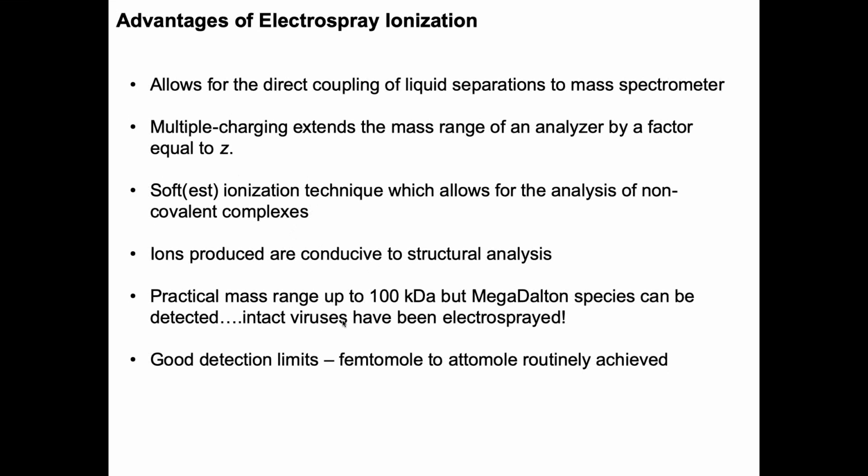All right. Yes, please. How will you optimize the matrix uniformity, like the density versus the laser excitation? So for MALDI, the question is how do you optimize the fluence, or the intensity, or the rate? How do you know that your sample is uniformly distributed, or how it's going to excite uniformly in different places?